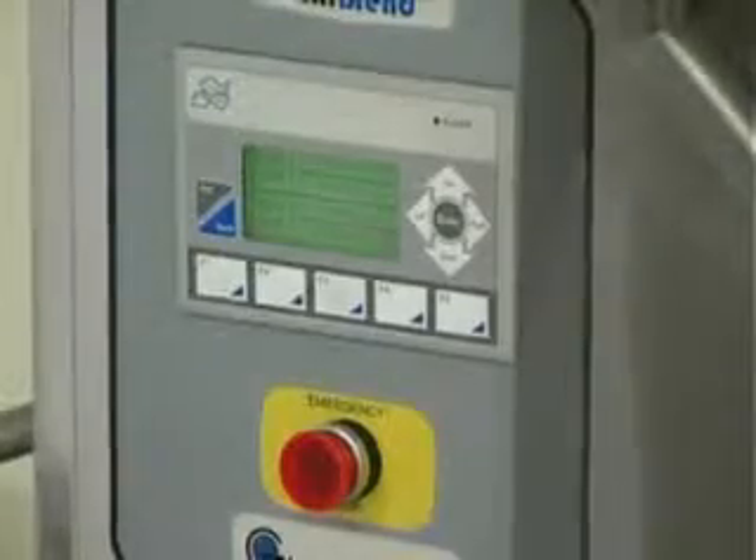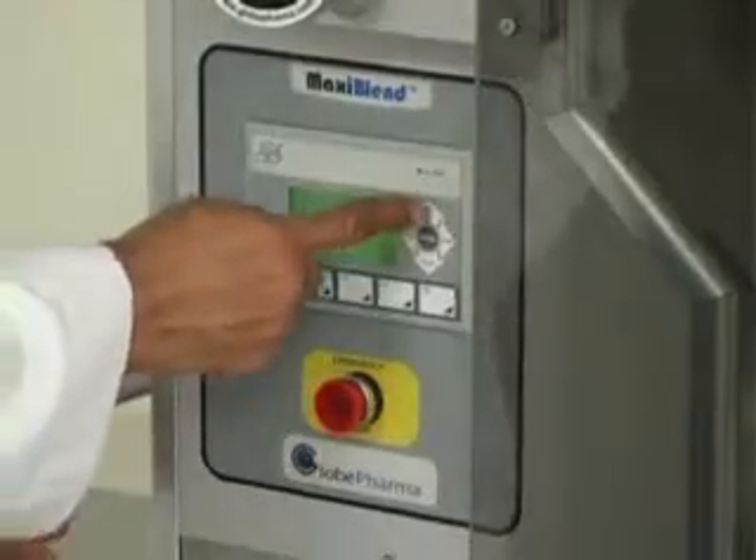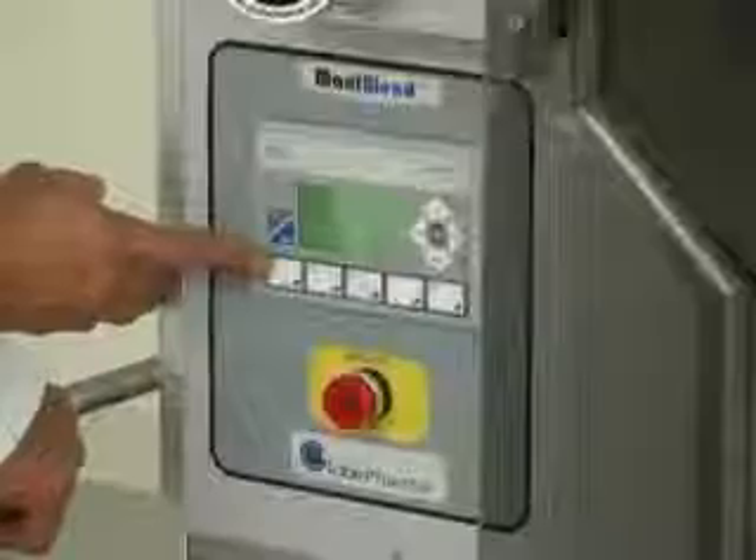Now we have set both times, so we go back to the previous screen by scrolling up. To run the machine you just press F1.